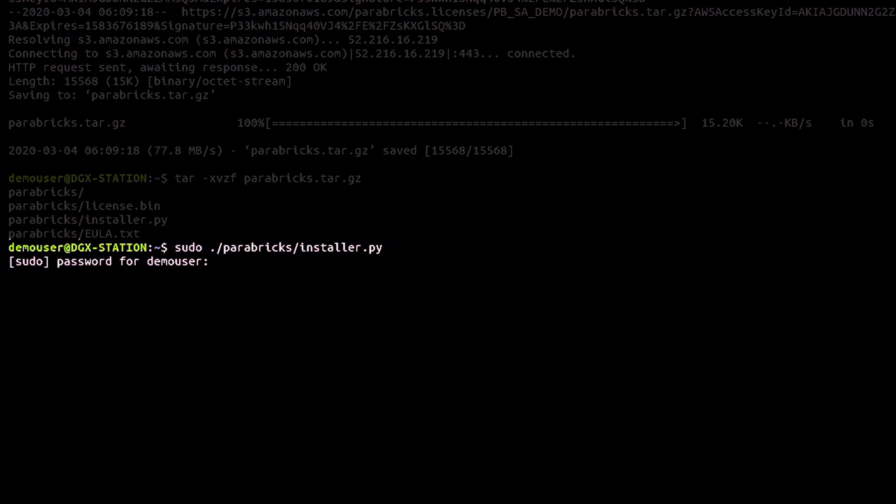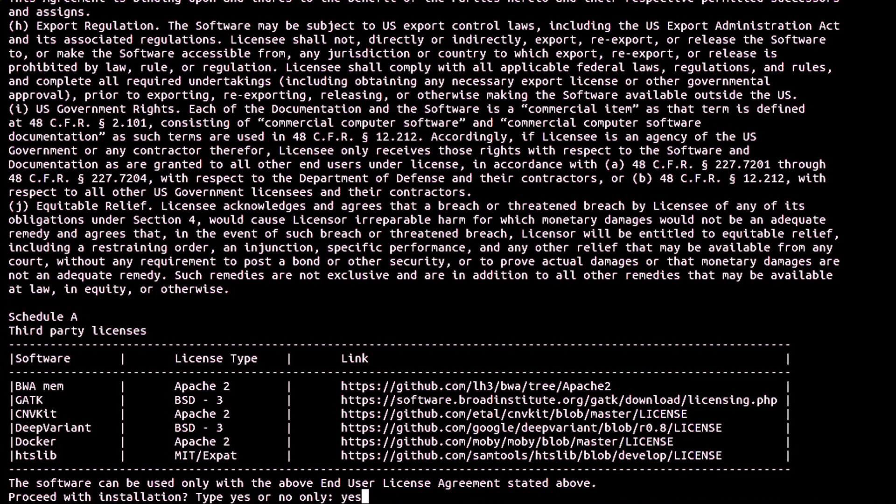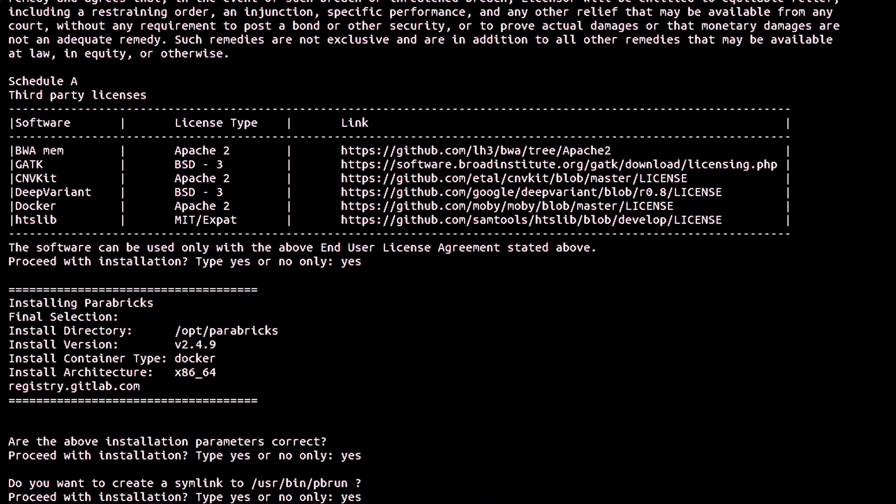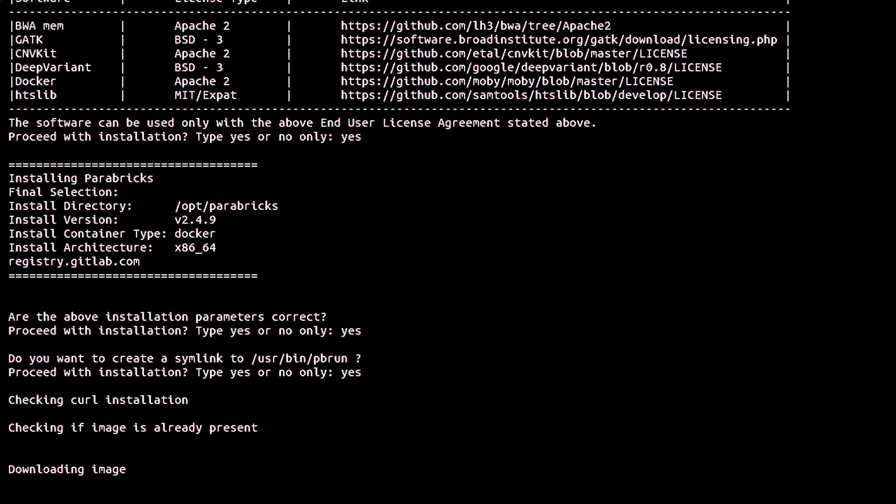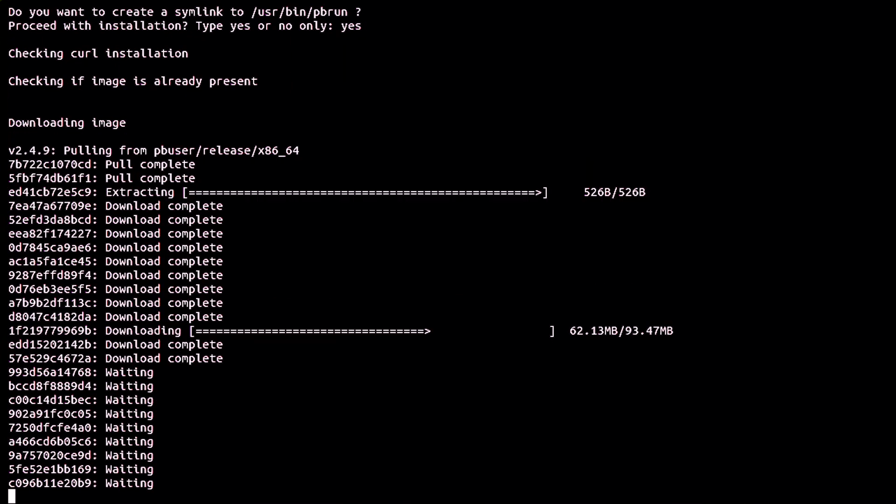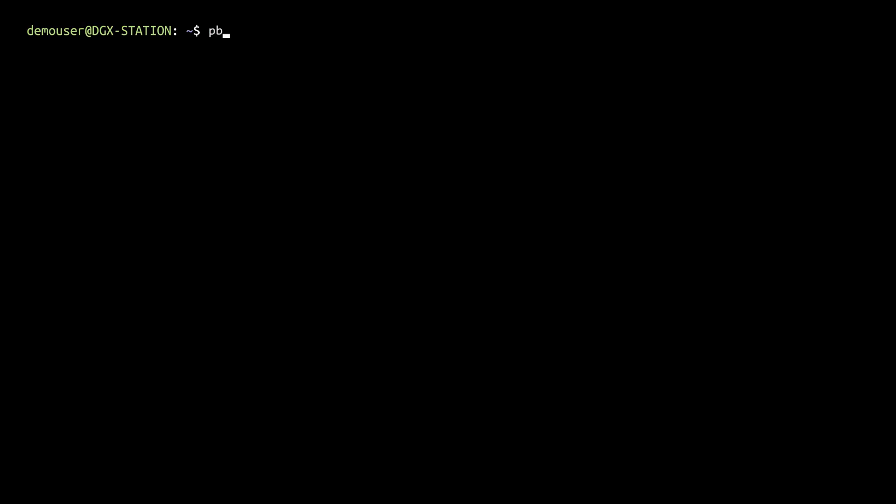Type in user password. Accept the end user license agreement. Confirm the installation parameters. Type in yes if you want to create a SIM link. Finally, verify your installation by typing pbrunversion. This should display the Parabricks version number.